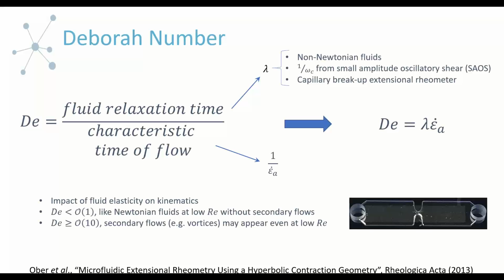And then technically you can also get a gauge. I didn't put this officially on the list because it's not the best way, I think, but if you wanted another way of getting a ranking for your materials, you could use the parameters that come from fitting non-Newtonian viscosity data. Viscosity is a function of shear rate, and there are different models you can use to fit that shear thinning, such as the Cross model and the Carreau-Yasuda model. There's a parameter in there that relates to this characteristic relaxation time, although it's not really the ideal way, but it could possibly work.